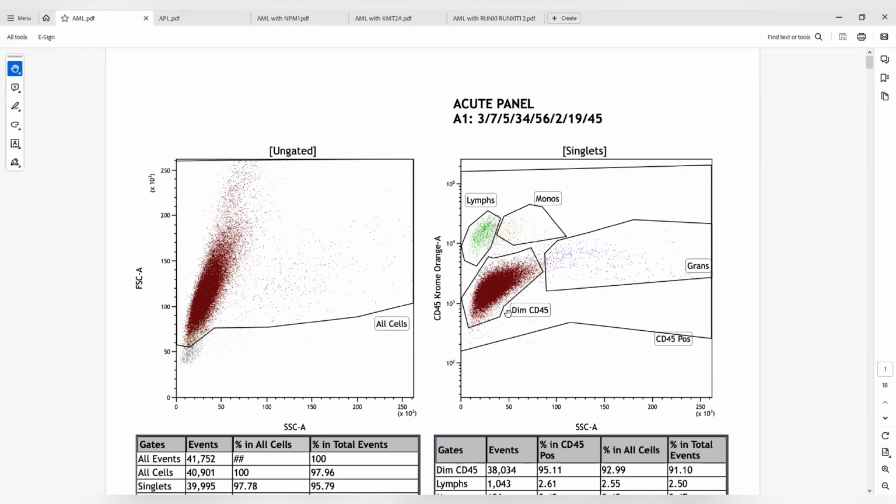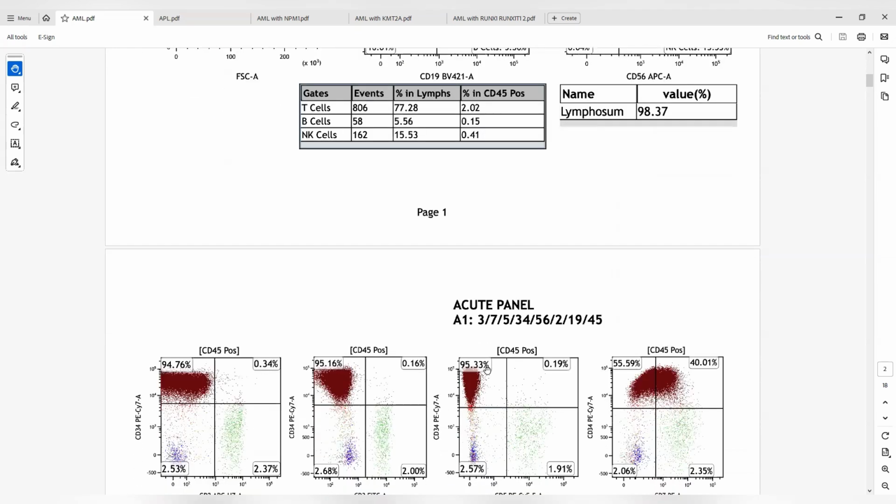And then in addition to that, myeloid blasts and monoblasts, they share common antigens like CD13, CD33, and CD11B, for example. But there are more specific markers for monoblasts, and these include CD11C, CD14, and CD64. And then by immunohistochemistry, you can use lysozyme. So let's look at this blast population. Let's look at this dim CD45 population here that we have, and let's see what's going on.